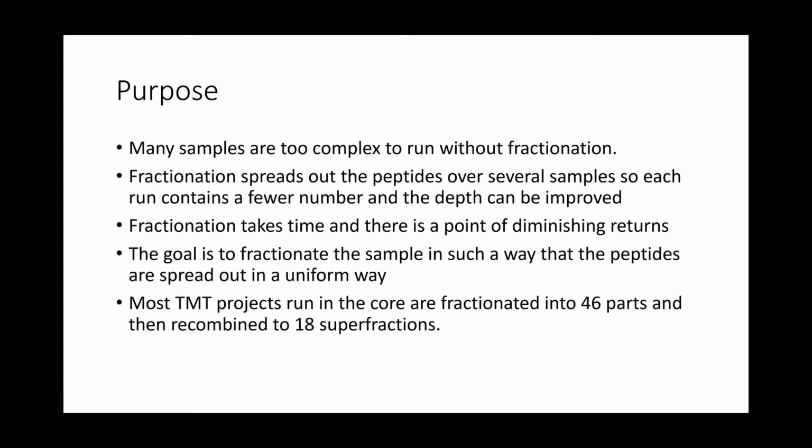Many samples are too complex to run without fractionation. If you have a cell lysate, there are tens or hundreds of thousands of proteins in that sample, and when you break those up into peptides by doing some sort of digestion method like trypsin, which is our normal bottom-up workflow, we have too many things to analyze in too short a period of time.